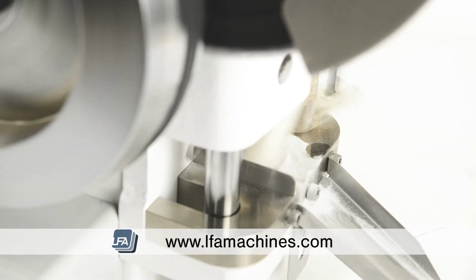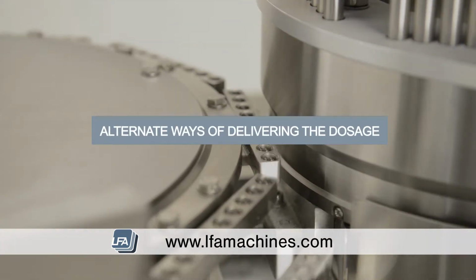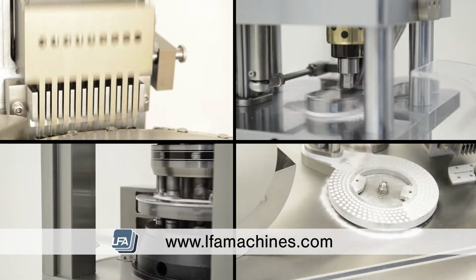As we explore the advantages and disadvantages of both options, it is important to point out that these are both just alternative ways of delivering the dosage. Ultimately, the choice will come down to a balance between the API and customer preference.